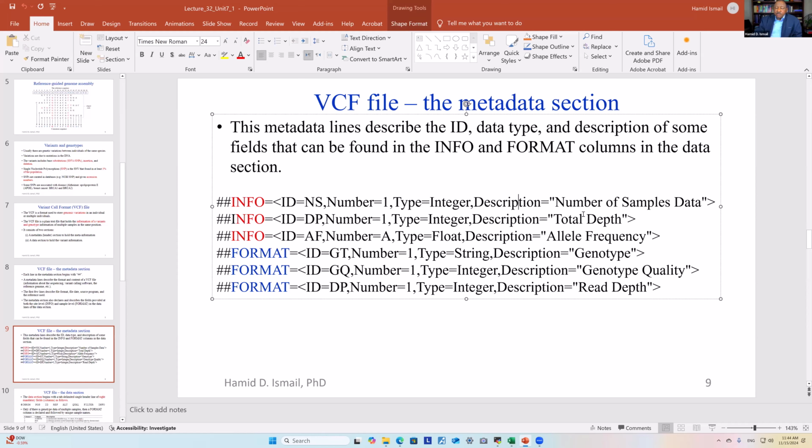The depth that you talk about, because if you find a variant, for example, a deletion or a substitution, and the depth is 1, it's not like if the depth is 10 or 20 or 200 or 1,000. More depth, more confidence. Less depth, less confidence. And sometimes we need to filter based on the total depth. For example, if the depth is less than 5, then we need to remove that variant, or not consider it. And I'll show you some examples.